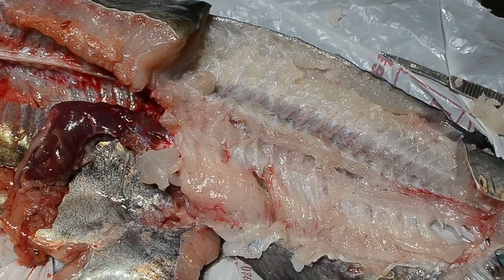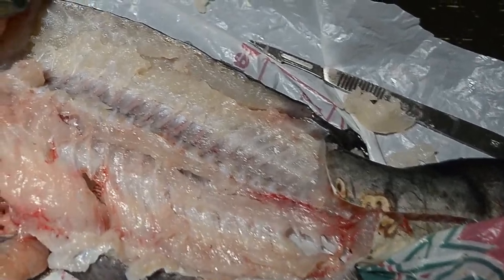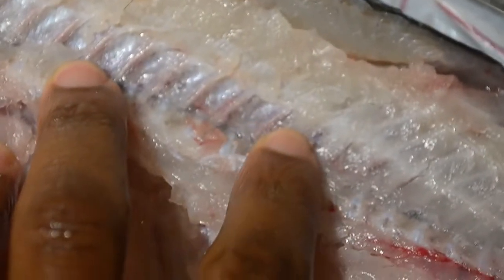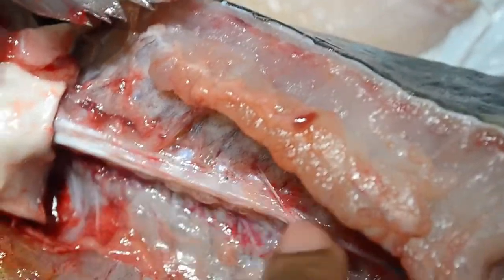Now I wanted to show you guys the backbone with the tissue still on it — you can see all the veins and all the other tissue that keep the bones together. That's the backbone right here. What I want to do next is get rid of all the flesh so you can see the skeleton.